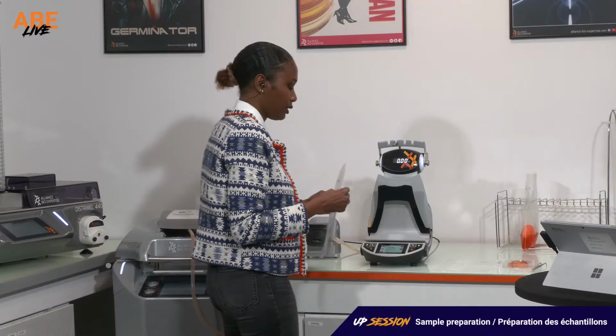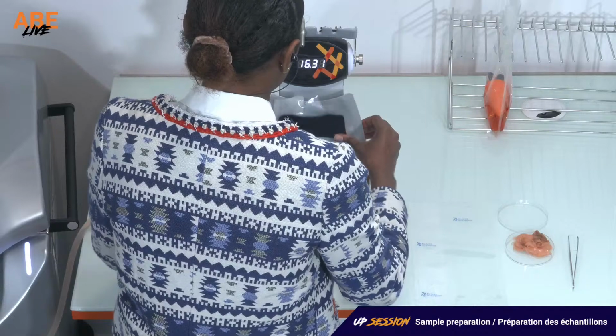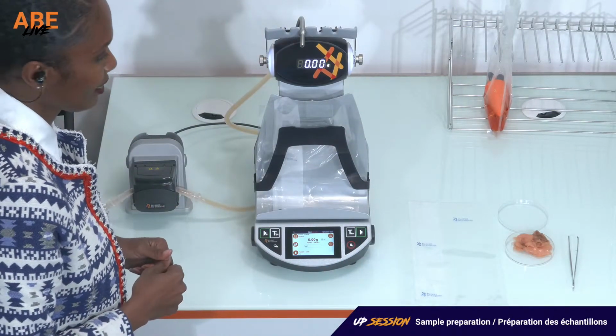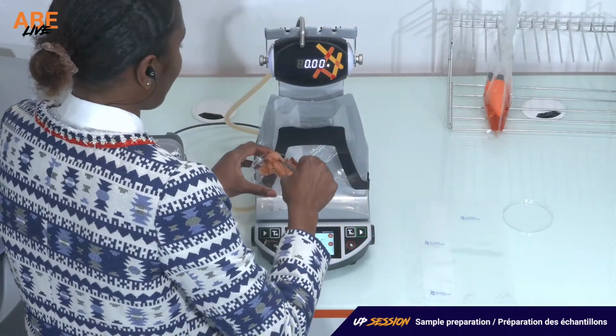As we did earlier, I will put my bag. And as you can see, it's automatically tared. Okay. So now I put my sample, which is my salmon.